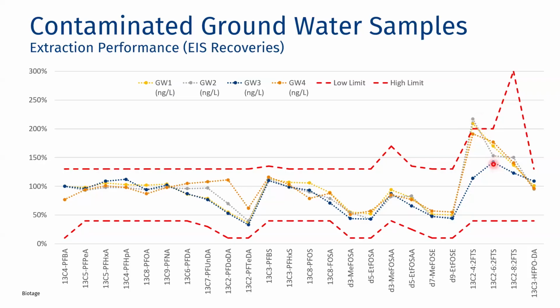However, the laboratory that we were working with would do multiple injections of these to make sure that they got these ranges to be as accurate as possible, since they have to dilute these samples to fit within their cal points. So this could have just been a product of instrument analytical inconsistency, but overall they were very happy with how well these samples processed and how well they fell within their acceptance criteria.